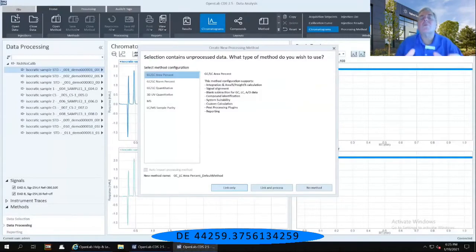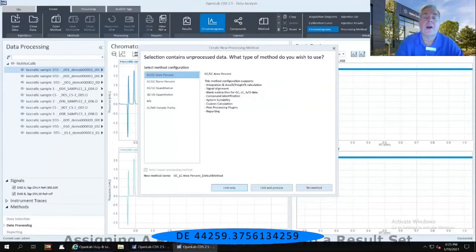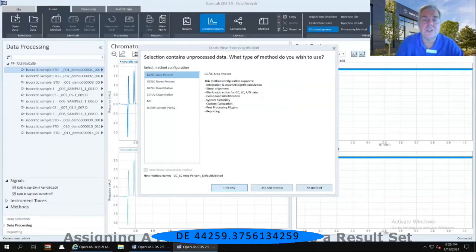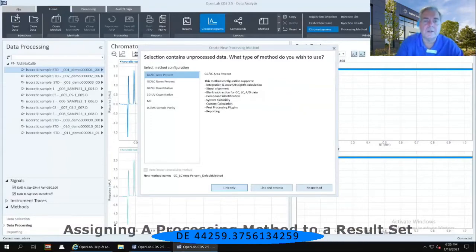When you are presented with a set of data that does not have a processing method associated with it, this is the message that you are going to be given.